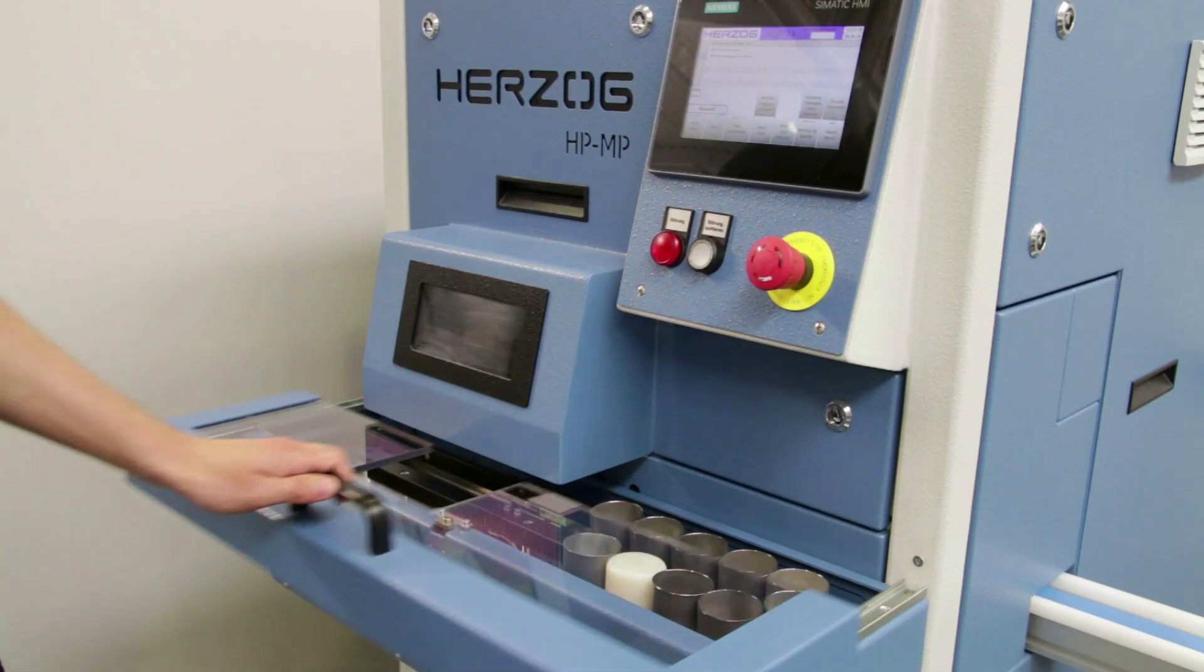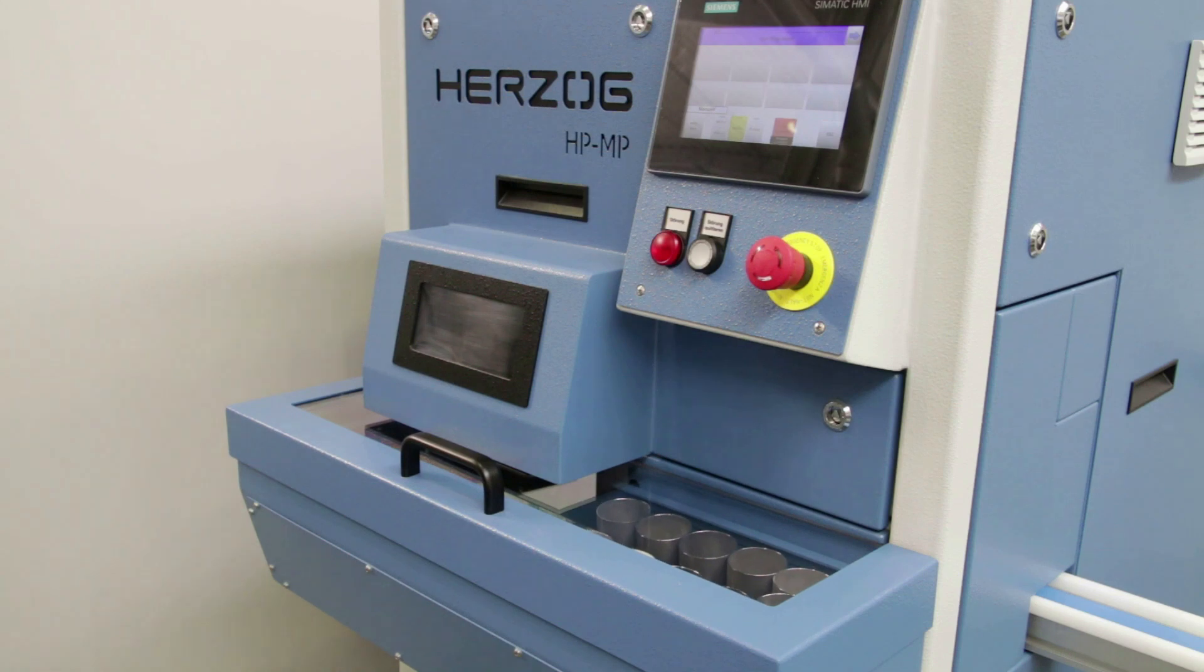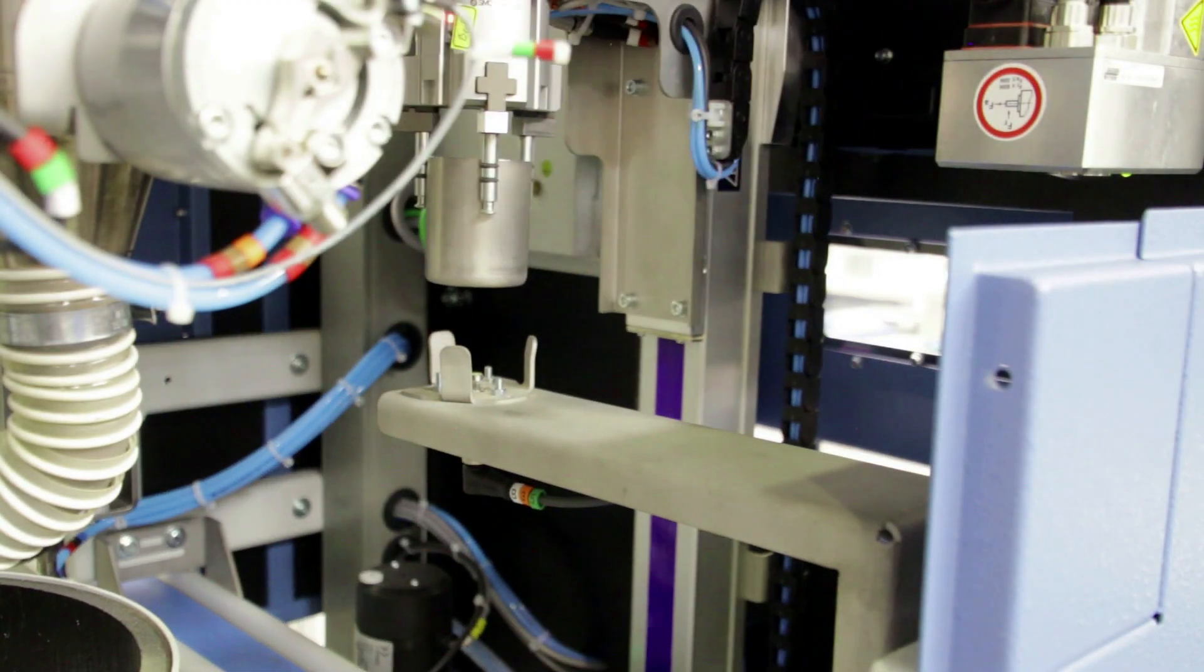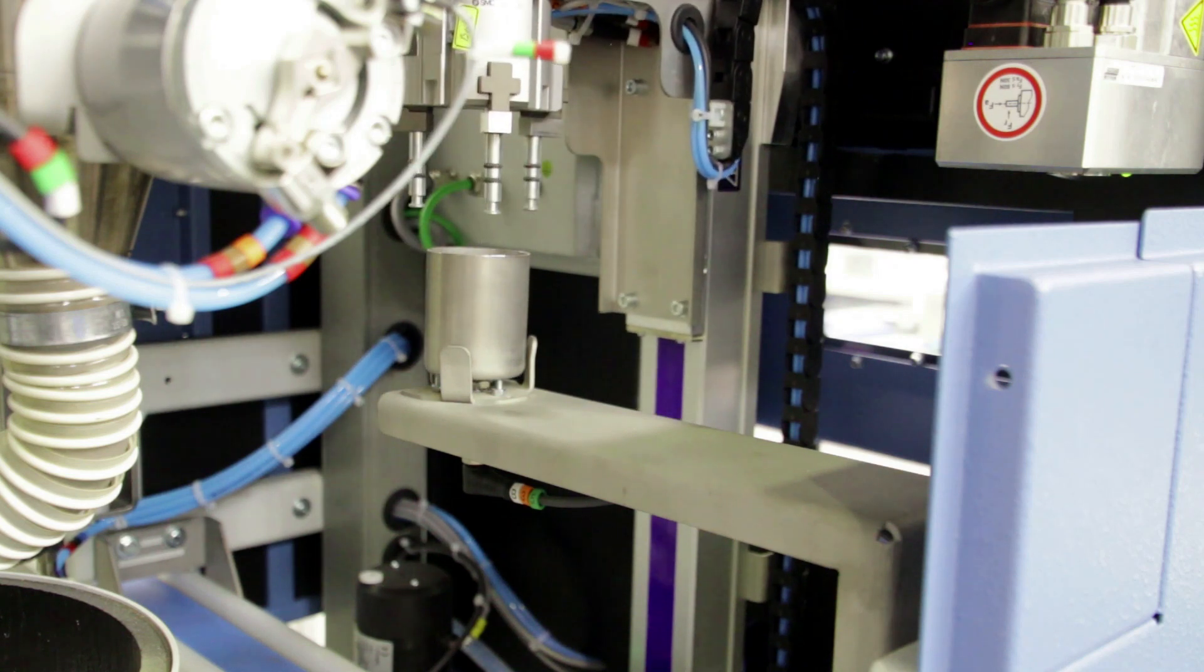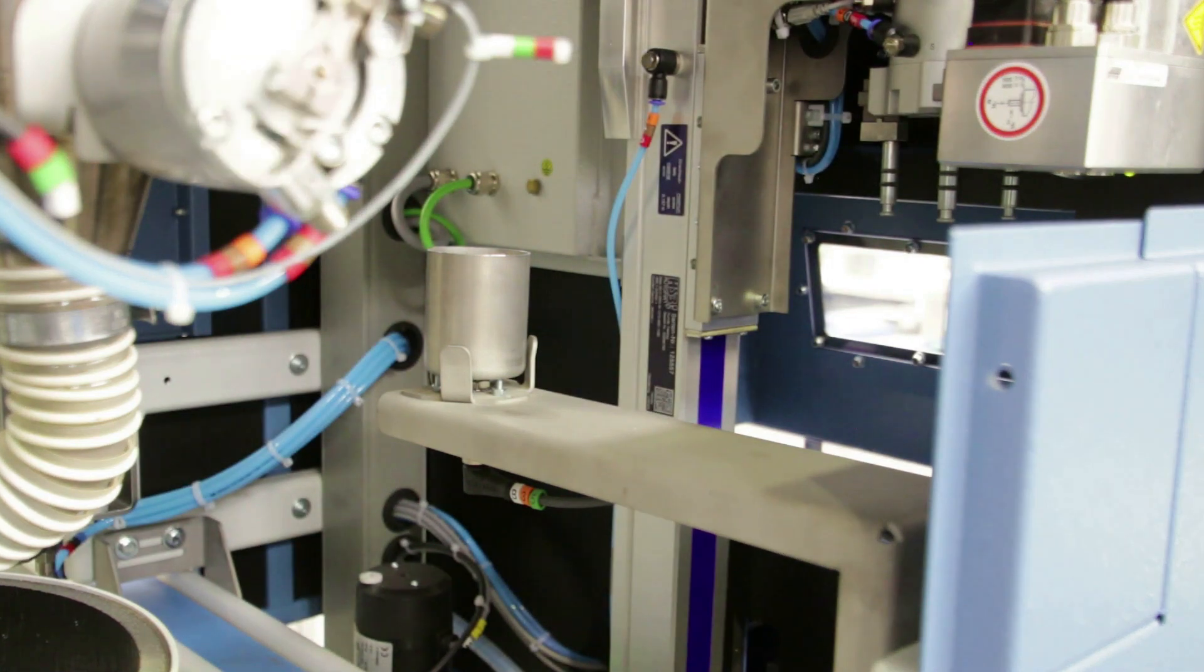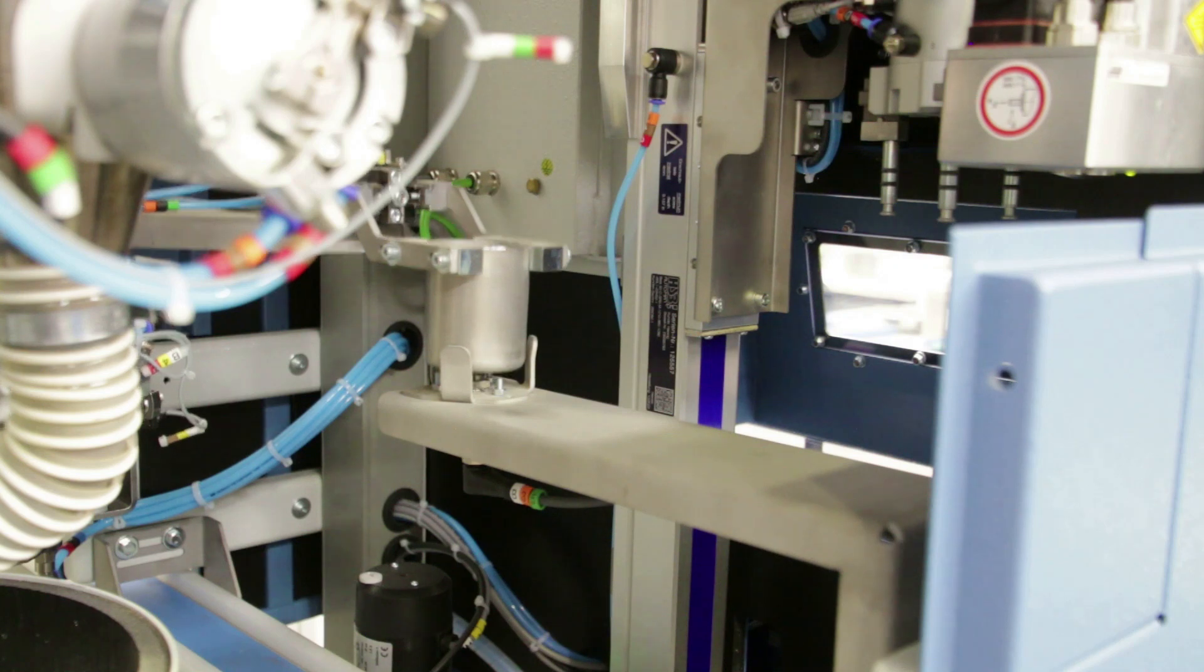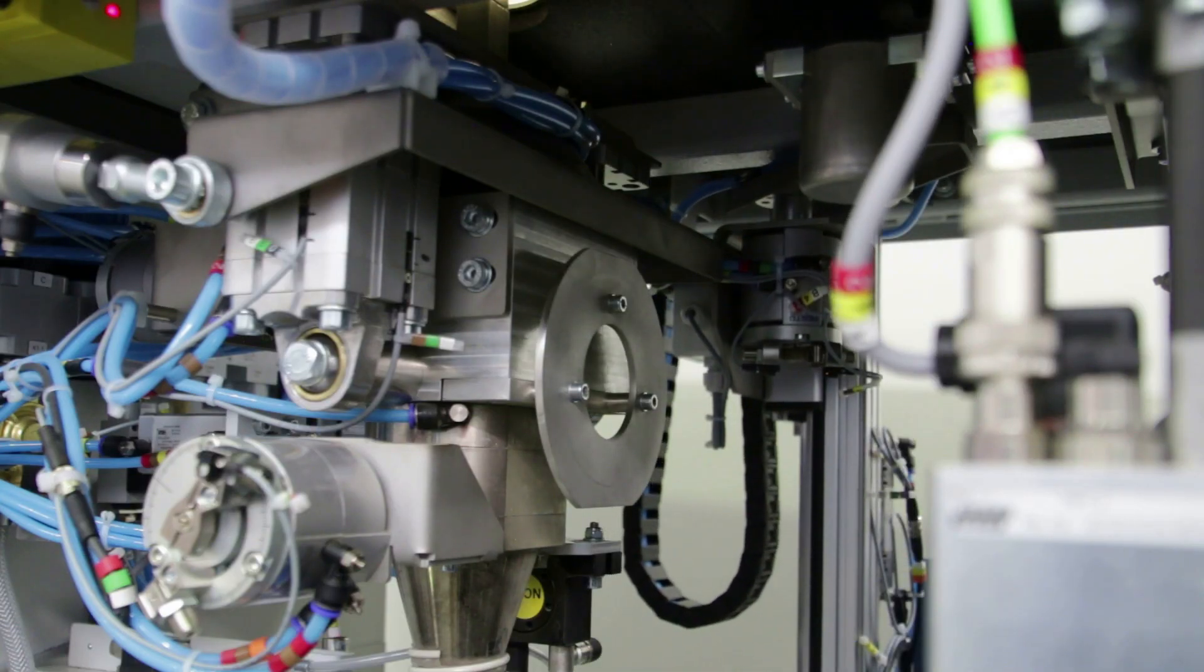Herzog introduces the latest and enhanced version of the HPMP combined mill and press. Designed specifically for laboratories in cement production and other primary industries, the HPMP is the ultimate solution for producing high-quality pressed pellets. With a focus on efficiency and user-friendly maintenance, all processes within the machine have been optimized.